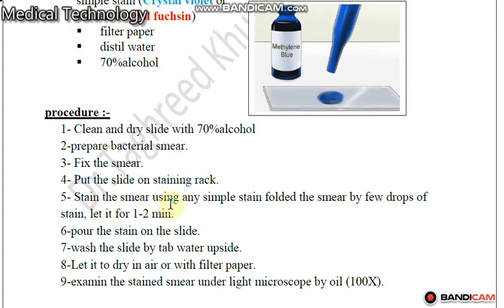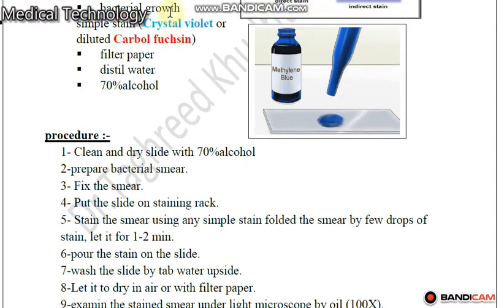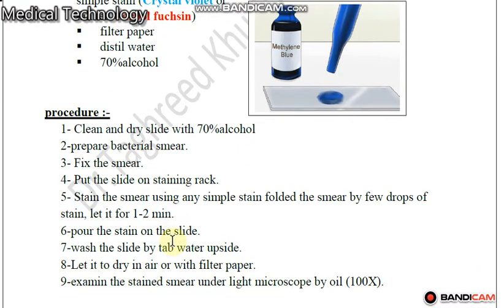Stain the smear by using any simple stain, crystal violet or carbol fuchsin, for 1 to 2 minutes.